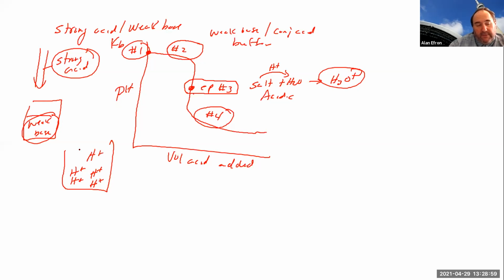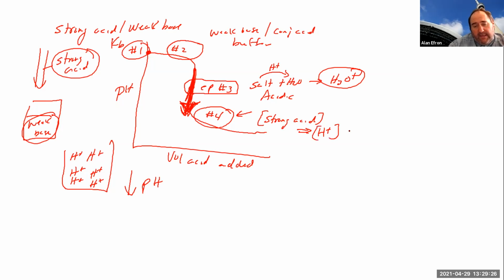So we're just littering the place with H pluses. That definitely would expect us to see a big drop in the pH, which obviously we do see here, coming downward as we're adding the acid to it. And because of that, you do need to do an ice table. That ice table will give you really the concentration of your strong acid. That obviously will get you to your H plus concentration and then get you to your pH at that point.